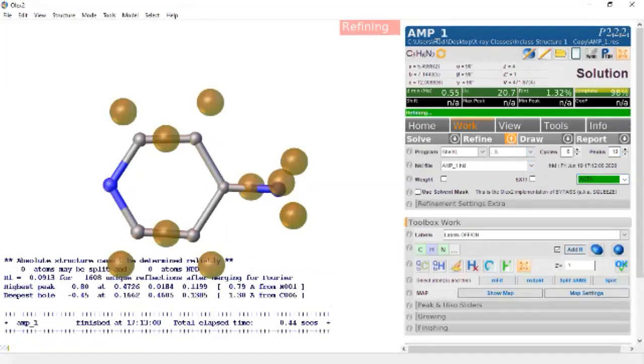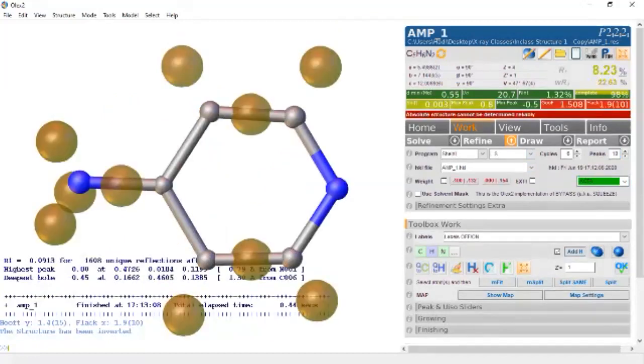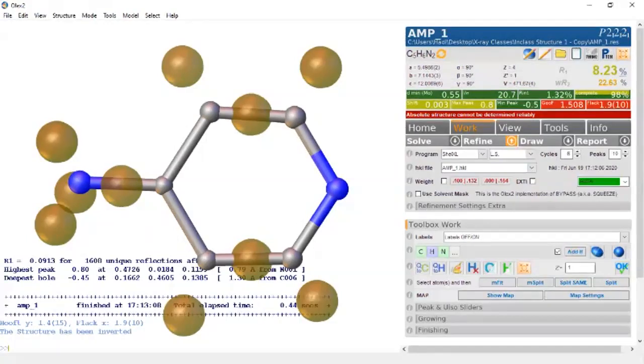So now you see that the electron density peaks left correlate to hydrogen atoms. So there's a peak here, here, off the carbons and off this nitrogen. So that's good. We've labeled all the non-hydrogen atoms. We've converged. Our shift is close to 0. That's good. Now you'll notice that this is isotropic thermal parameters, where we treat every atom as a sphere. The next step is to treat atoms as ellipsoids.